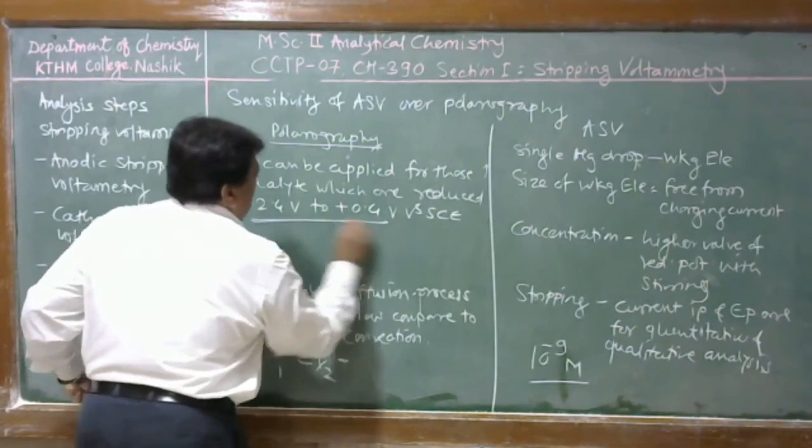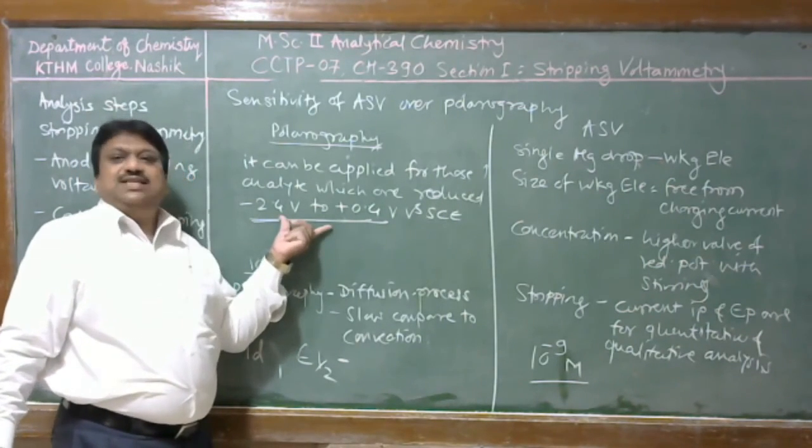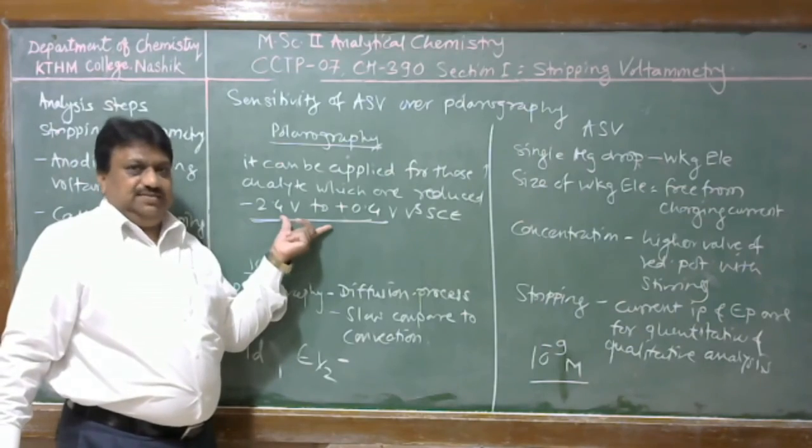Therefore, whatever metal ion or analyte species are reducible within this potential range can be determined.